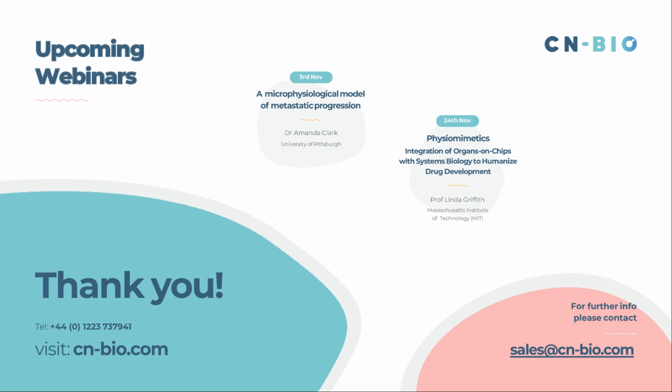And then the second half of the question was related to common media. So this is again a key thing that we've worked on a lot over a few years, and we think very hard about when we build methodologies and protocols for using multi-organ platforms. We generally can develop common media for multi-organ platforms.